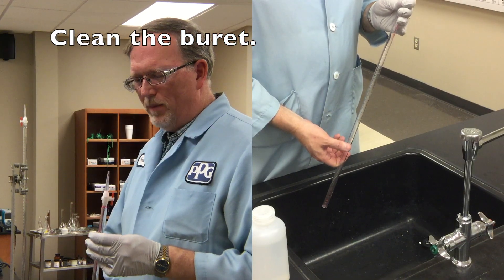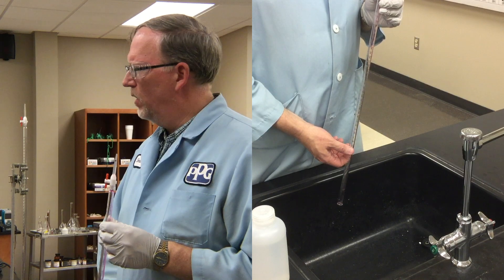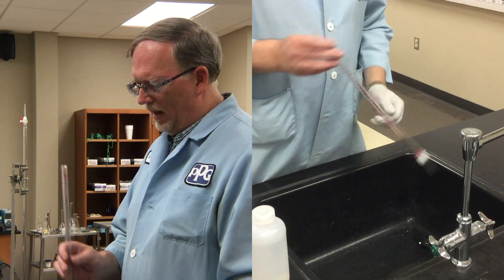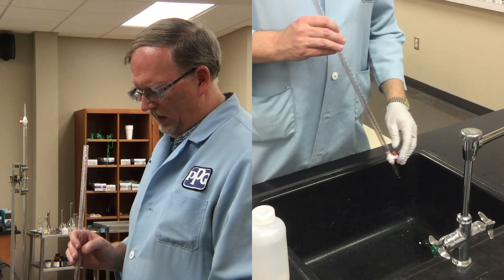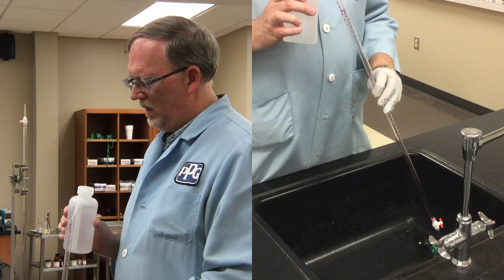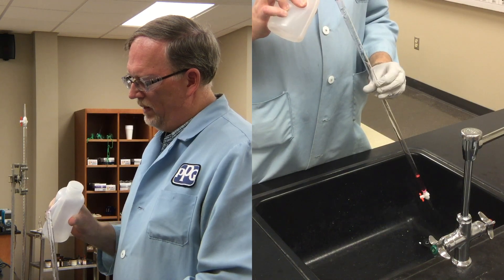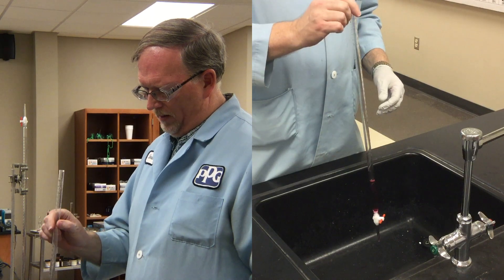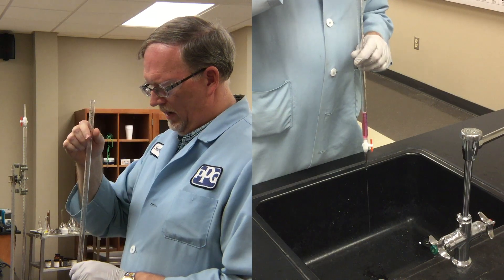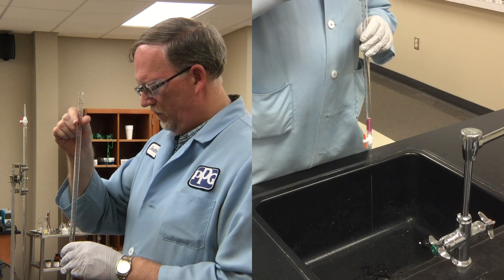We have a rather dirty burette here that we need to clean. You should always assume, unless you know otherwise, that the burette is dirty, and we need to remove whatever is inside. Dr. Smith-Hart is using a burette with some red food coloring in it for demonstration purposes. The first step in cleaning the burette is to get a squeeze bottle with some distilled water and add a few milliliters of water while twisting, so that you can rinse the inside of the burette. Next, we want to let that water flow through the tip. You can shake it up and down a little bit to make sure any particles get taken out.